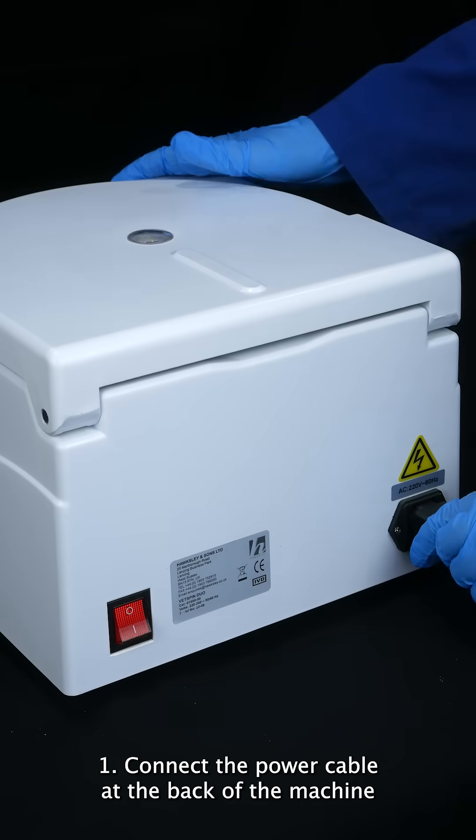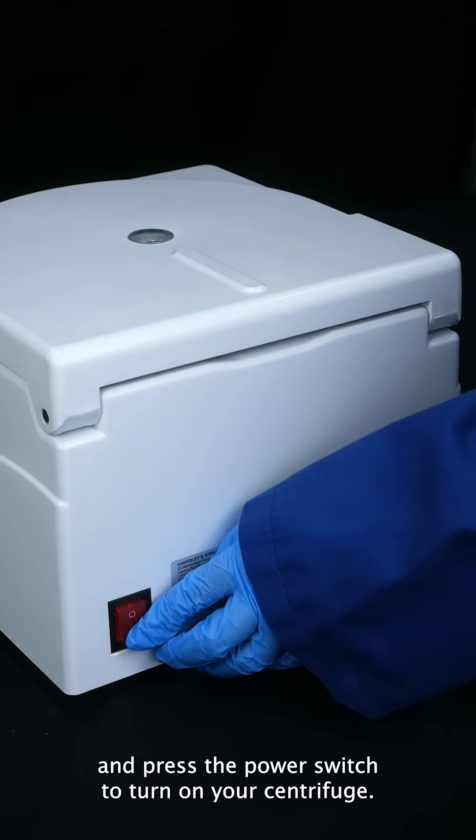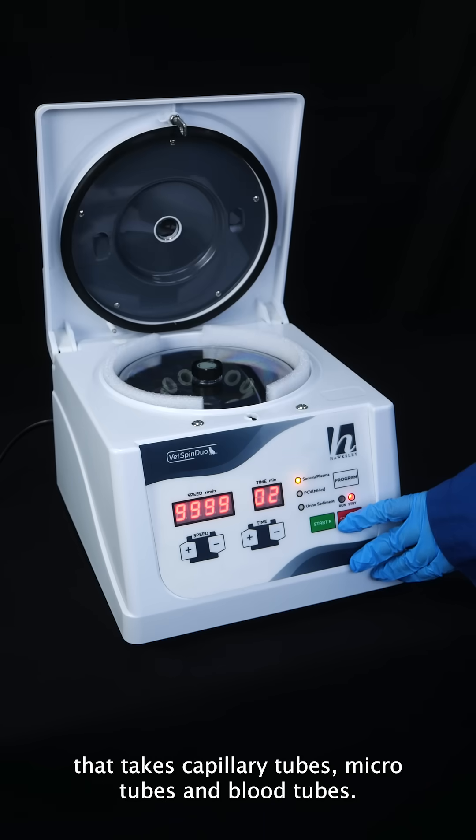Connect the power cable at the back of the machine and press the power switch to turn on your centrifuge. The Vetspin Duo has a combination rotor that takes capillary tubes, microtubes and blood tubes.